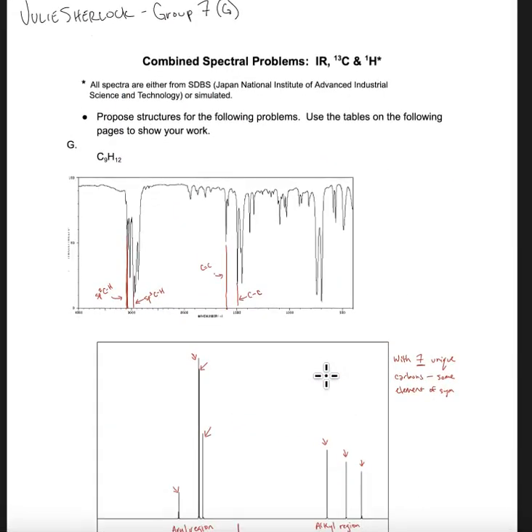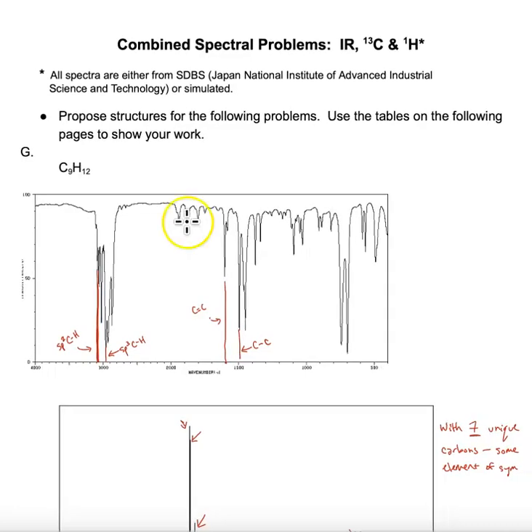Going back to our IR spectrometry graph and taking a closer look. First off, IR spectrometry is helpful in spotting functional groups, checking to see if a chemical reaction actually took place, seeing what different functional groups are present, and double checking the purity of your compound. In this case, we are going to look for different functional groups present, to help us identify our compound.